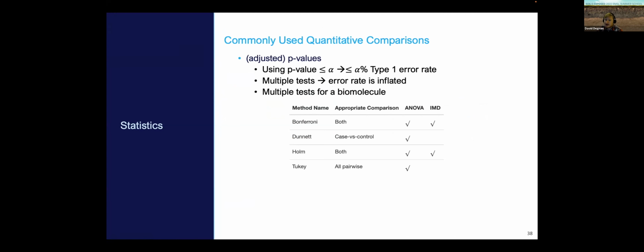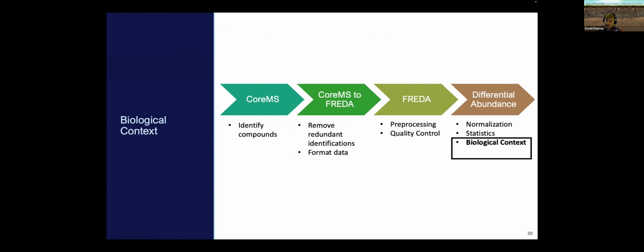So now that we've got this statistical comparison, I've got these biomolecules of interest. What can I do with that information? And how does that help us answer our initial question, which is what is the difference carbon-wise between our stressed sample from the upper to lower transplant and our lower transplant?